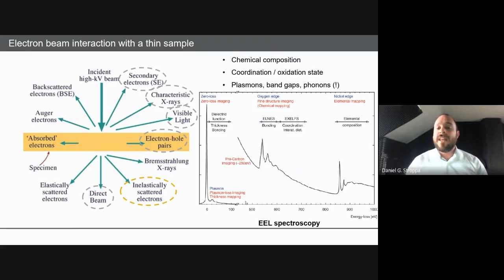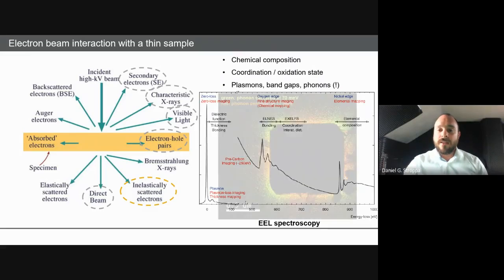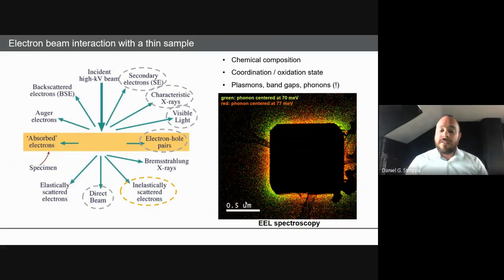And nowadays, we're starting to get resolution enough to understand phonons inside the TEM. Of course, the energy resolution is not there yet to compare with X-ray techniques, but the compromise is that the spatial resolution is much higher, as you can map locally these effects. So this example here is the measurement of phonon distribution at the sides and the edges of a magnesium oxide cube, and it's possible to distinguish the phonon modes that you have at the surface and at the corners here.